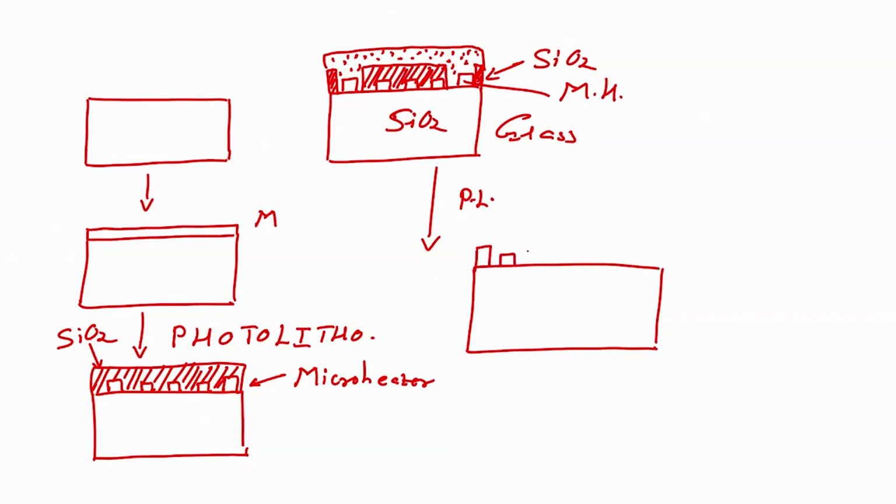We will have the heater, the insulator, the contact, the heater coils, the interdigitated electrodes, and this is our insulator, correct.